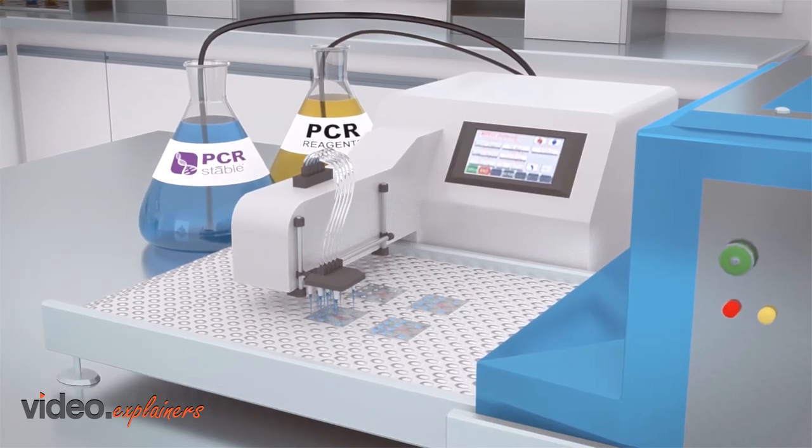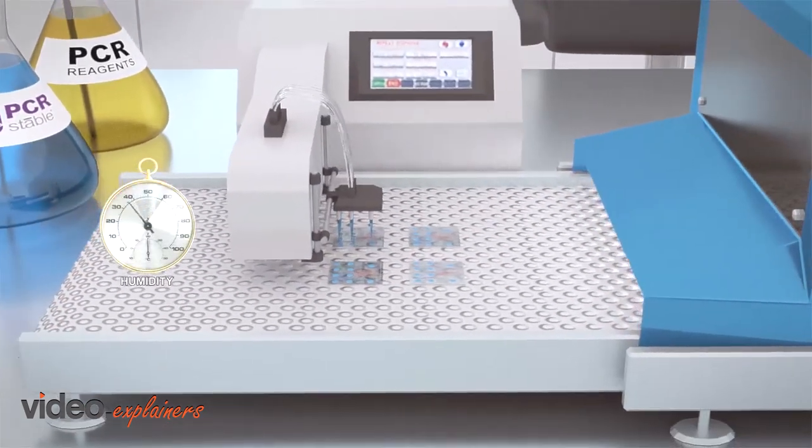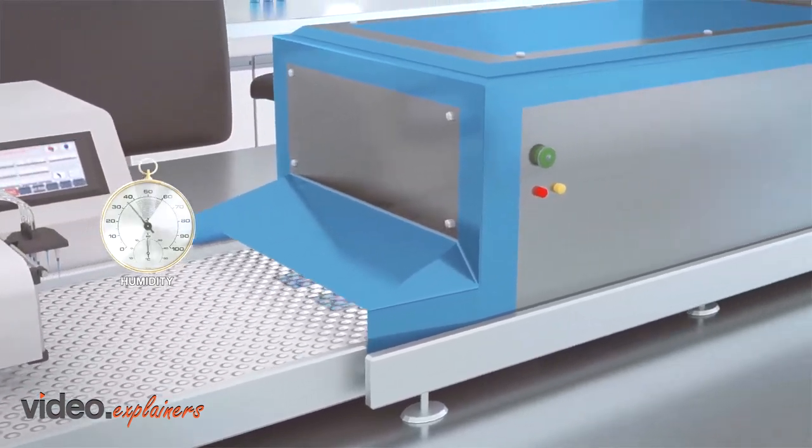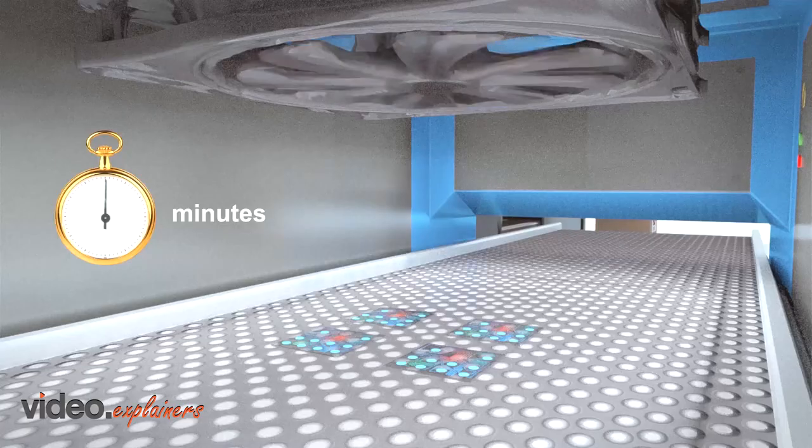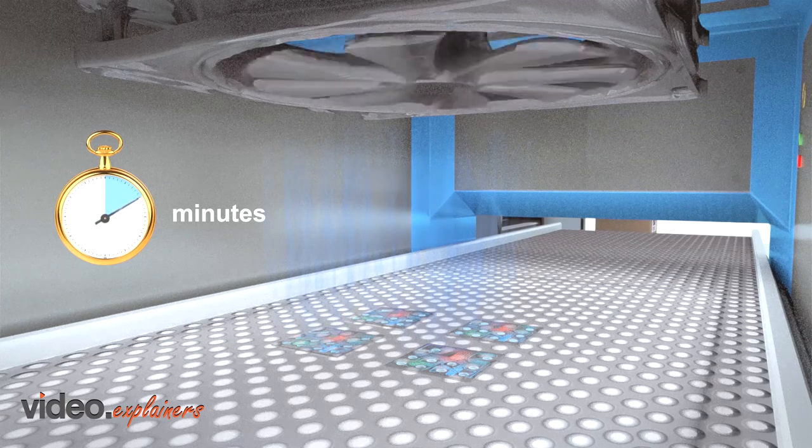PCR Stable is compatible with automated dispensing and does not require rigid humidity control. A drying tunnel can be used for continuous production of dry assays. Trays loaded with chips containing microliters of assay reagents will dry in minutes.